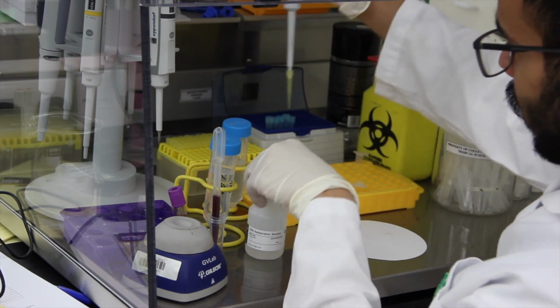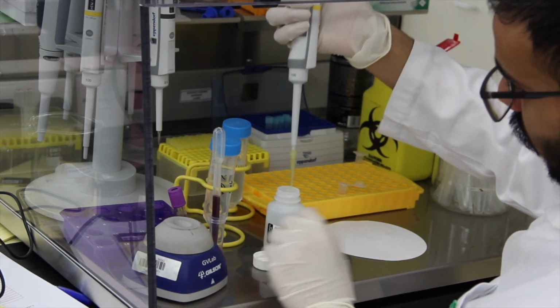After completely drying your pellet, add 100 microliter of DNA rehydration solution.